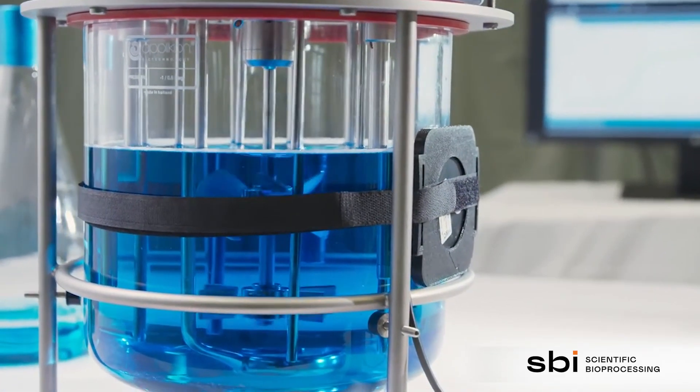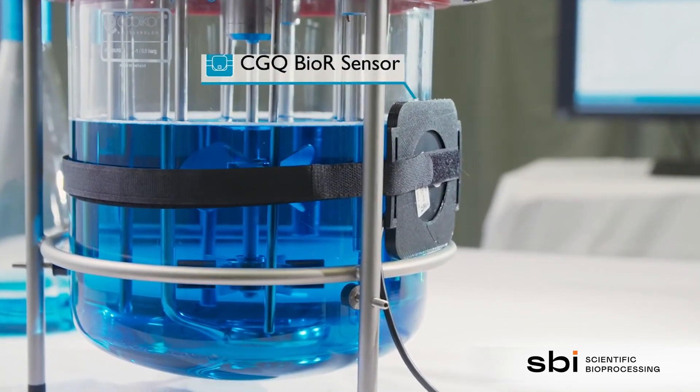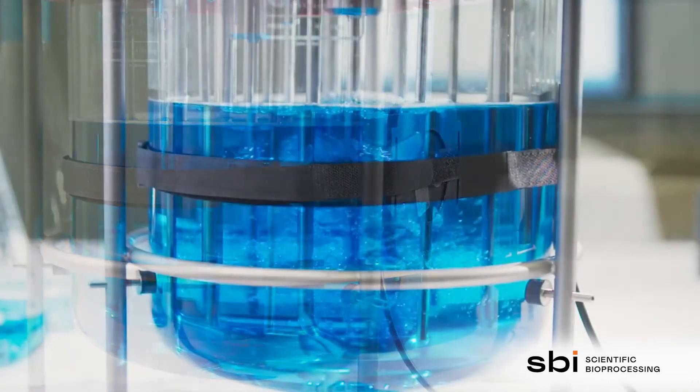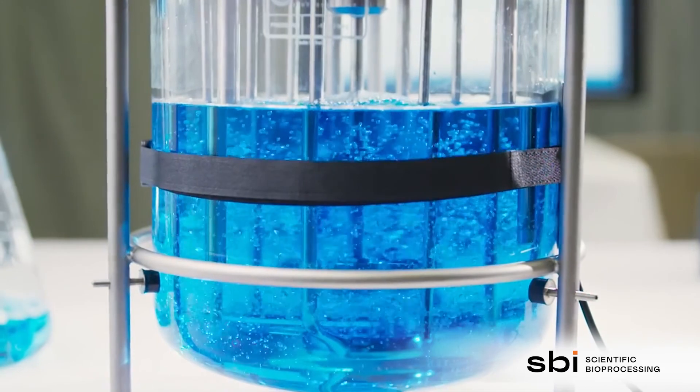In comparison to the CGQ, the CGQ BioR utilizes the same principle of measurement but was specifically developed for non-invasive online biomass monitoring in bioreactors.